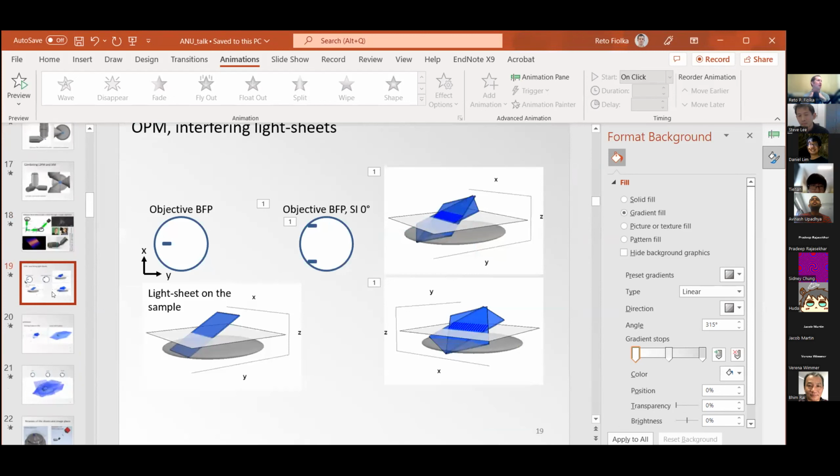At the moment, this might be difficult to explain without the appropriate cartoon. So in short, no. We currently use a Michelson interferometer with which we can create two beams, and each beam can be controlled with the mirrors in the interferometer to be positioned where we want it in the pupil. This is quite hand wavy, I'm sorry, but essentially think of a beam splitter that creates two beams, and each beam is individually controlled. Maybe I can find the drawing.